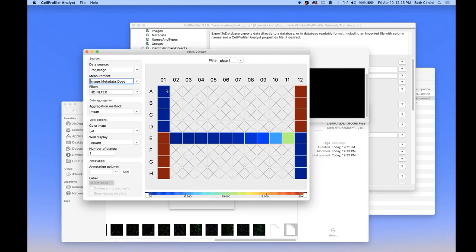And you can see the way this plate was laid out was, their negative control wells were in the top half of column 1 and the bottom half of column 12. The positive control wells vice versa, the bottom of column 1 and the top of column 12. And across the middle here was my dose response curve. If I change the slider here so that we can see more, it becomes a little more obvious that that's where my dose response curve was. It's not that easy to see just because this was a log dose curve.